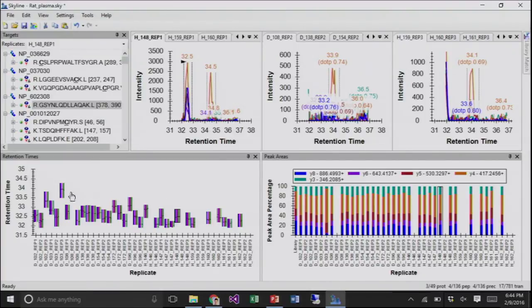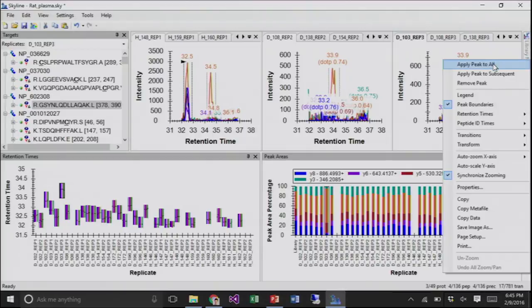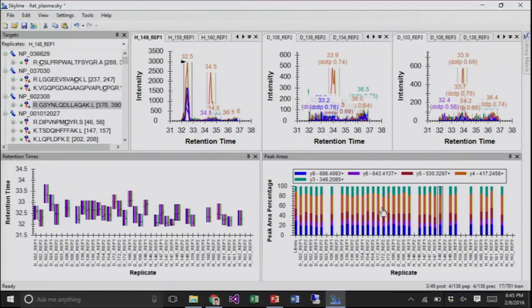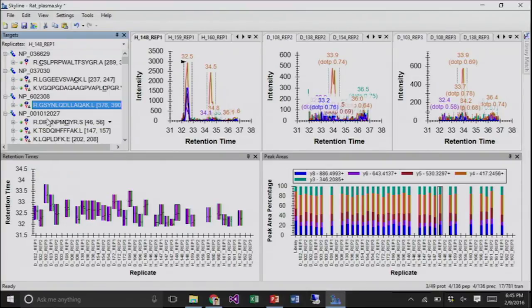And then, I guess, is this that one? Yeah, okay. So, yeah, and remove peak. So fairly quickly you can get through and remove them all, and now you have pretty stable retention time and pretty stable relative ion abundance and a lot of missing values. And we can run statistics on that, and I don't know what that will tell us.